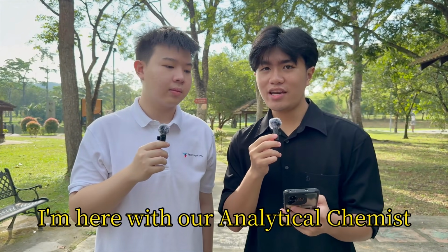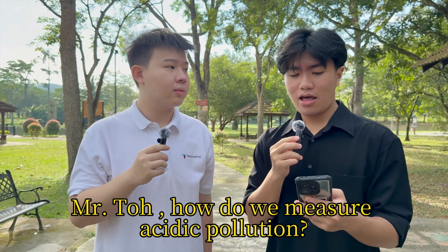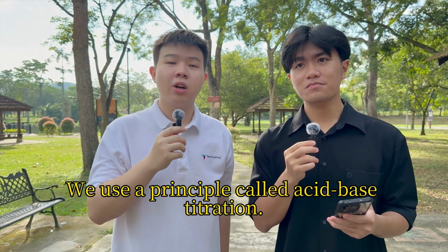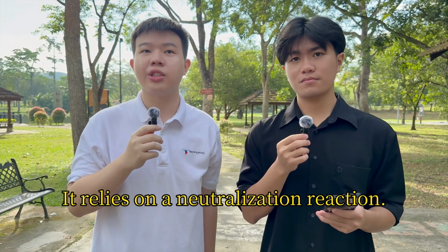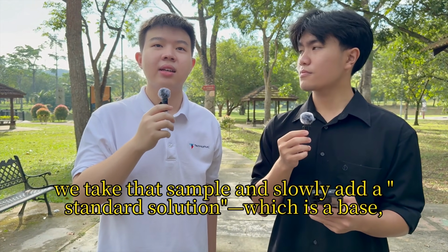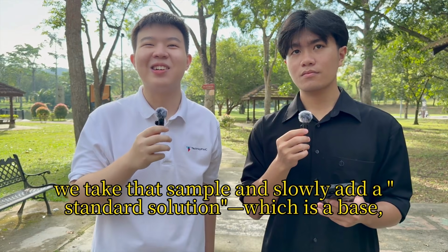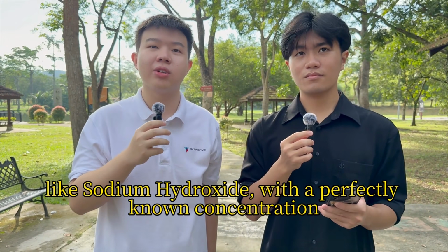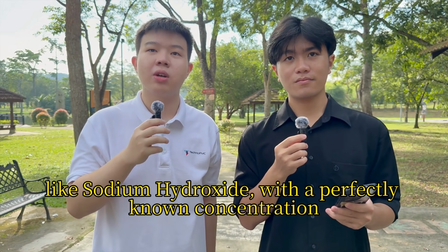I'm here with our analytical chemist, Mr. To. How do we measure acidic pollution? Okay, we use a principle called acid-base titration. It relies on a neutralization reaction. If polluted river water is highly acidic, we take that as a sample and slowly add a standard solution, which is a base like sodium hydroxide with a perfectly known concentration.